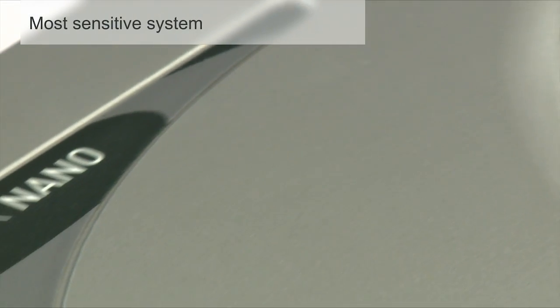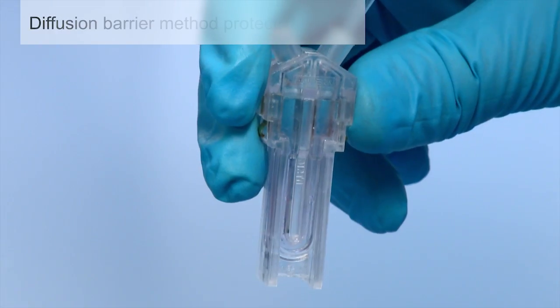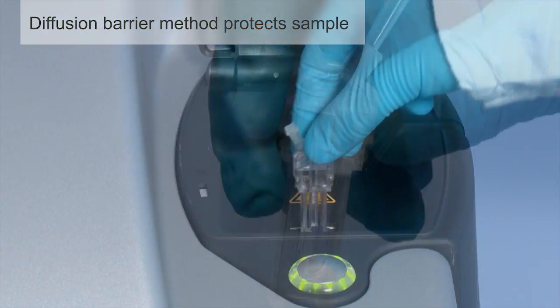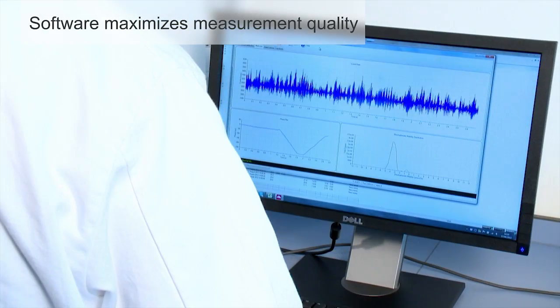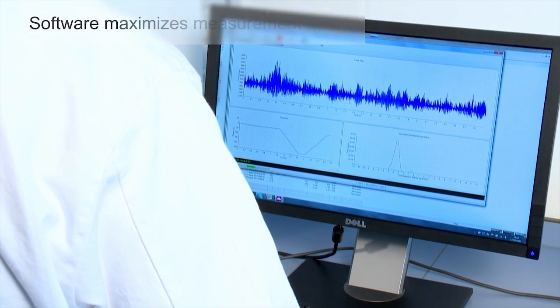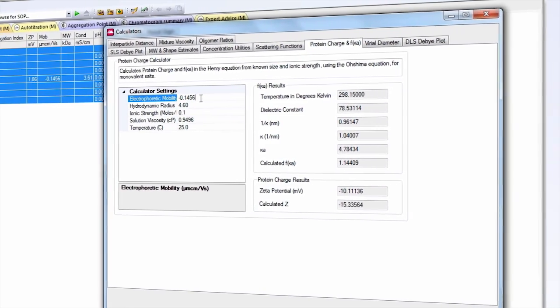To summarize, the Zetacizer Nano ZSP measures at concentrations as low as 1 mg per ml. The diffusion barrier method helps protect the sample from aggregation. The software automates the measurement and assesses measurement quality. The Protein Charge Calculator allows you to calculate protein charge from the measured mobility.